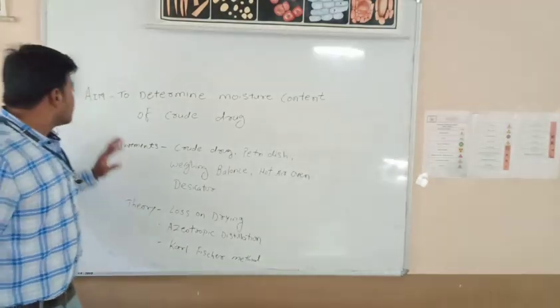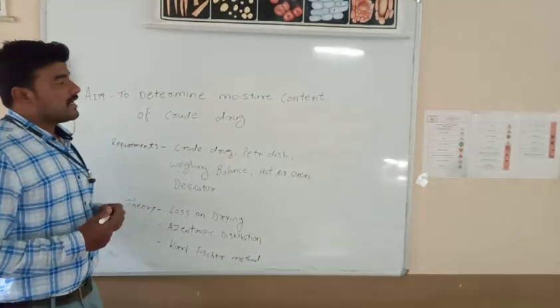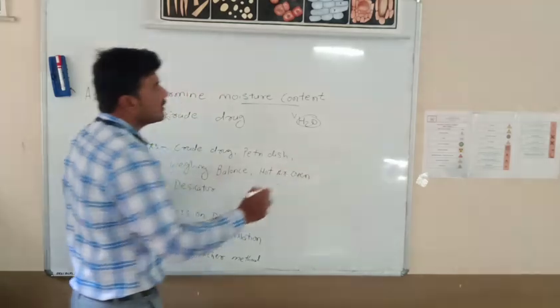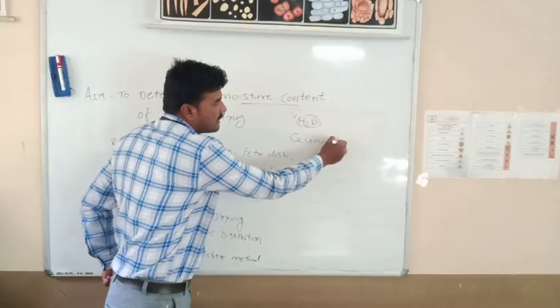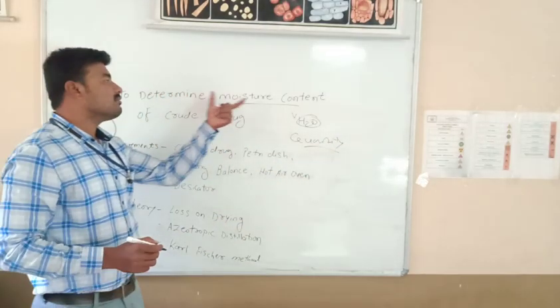Coming to the theory, moisture content is the amount of water present in a crude drug. We have to determine what quantity of water is present in the crude drug, and that is the moisture content.